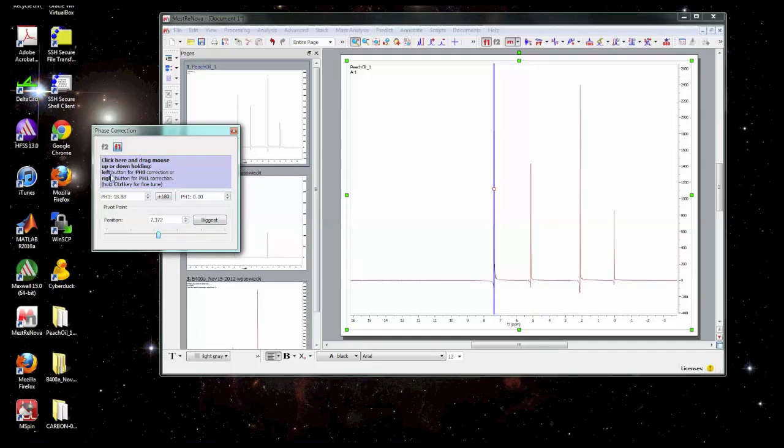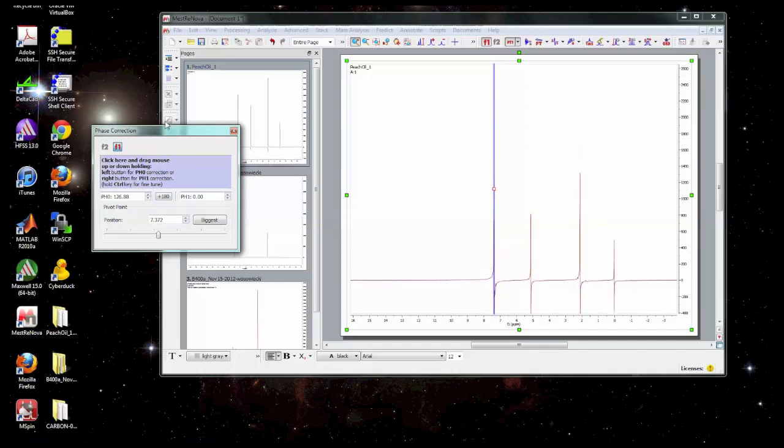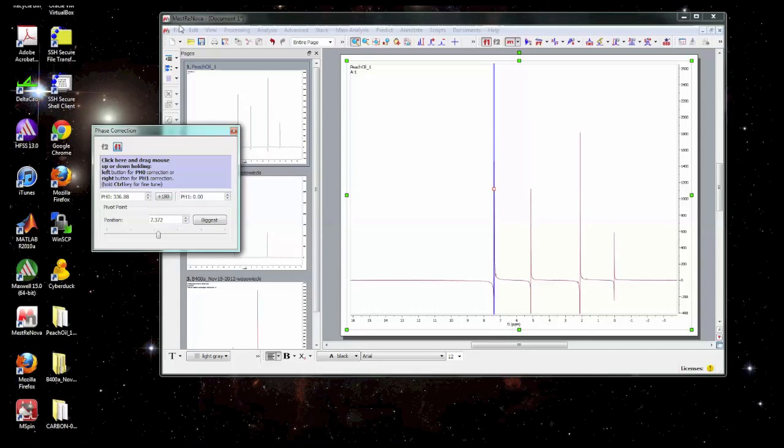And then we're going to adjust the zero order phase correction and try to fix the phasing on the spectrum. So I'm going to click the left mouse button in the box and drag it up and down to adjust the phasing. So you can see this is what I expect for an in-phase spectrum. This is something that's 90 degrees out of phase roughly. If it's upside down then it's 180 degrees out of phase. This would be 270 and then we're back to in-phase.